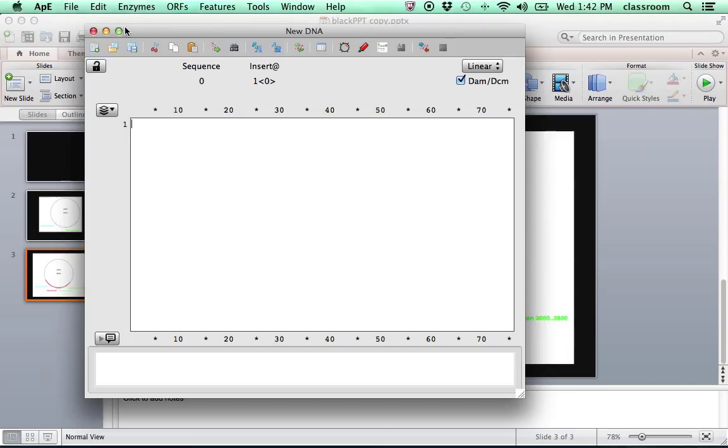Hi. In this demo, I will show how to use APE, a plasmid editor, to analyze a pair of PCR primers.